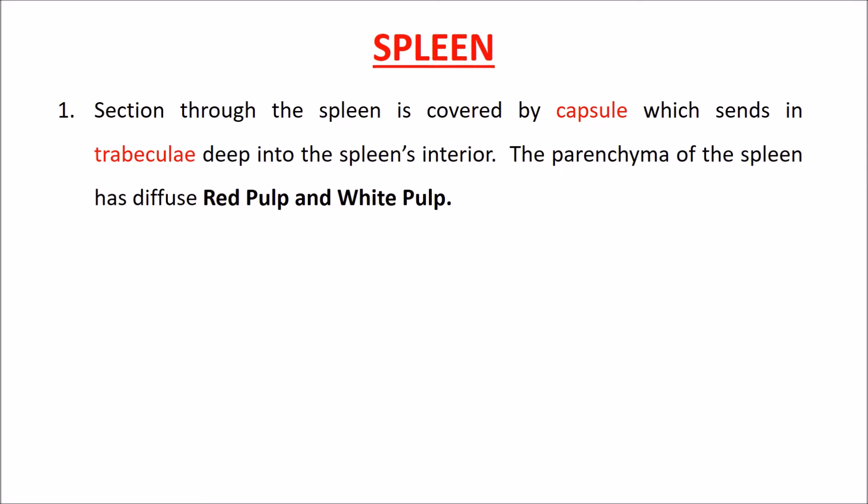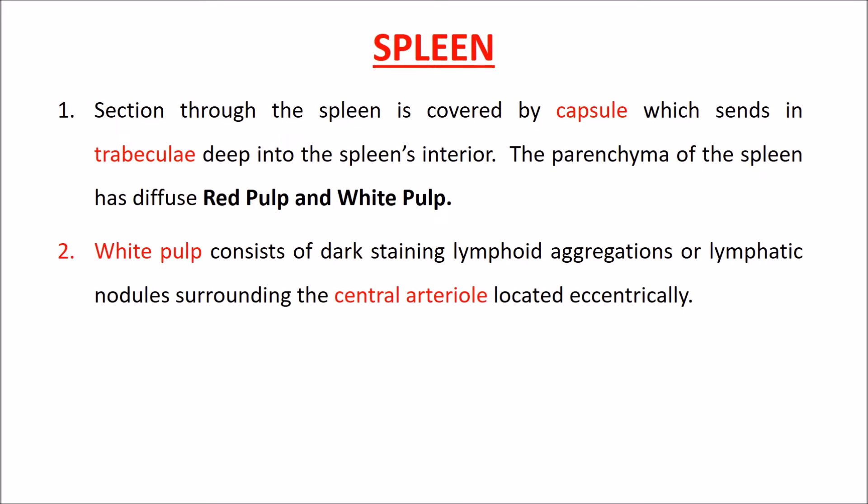The parenchyma of the spleen has diffuse red pulp and white pulp. White pulp consists of dark-staining lymphoid aggregations or lymphatic nodules surrounding the central arteriole, which is located eccentrically.